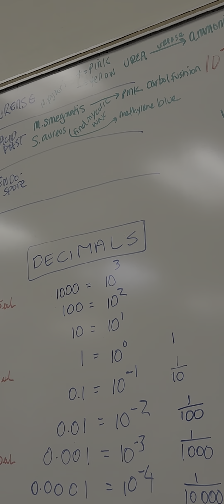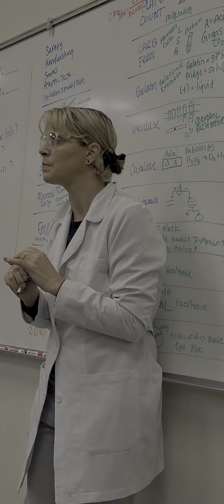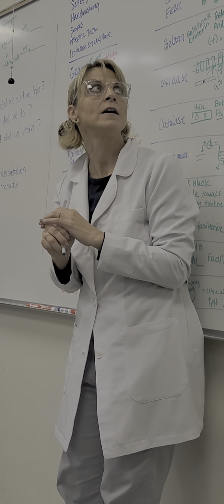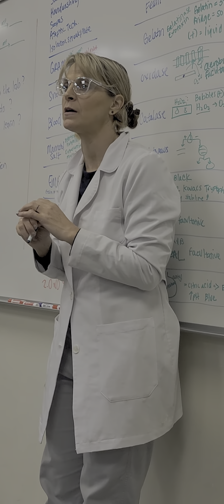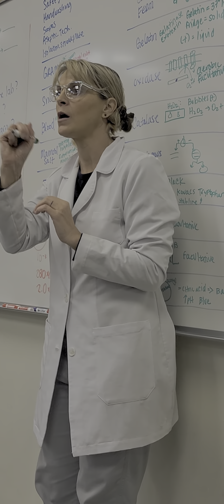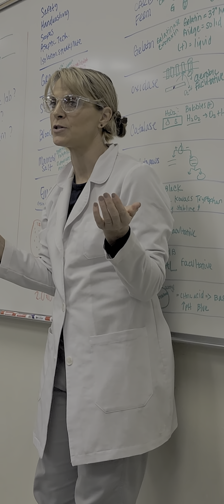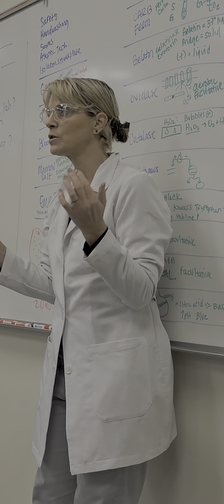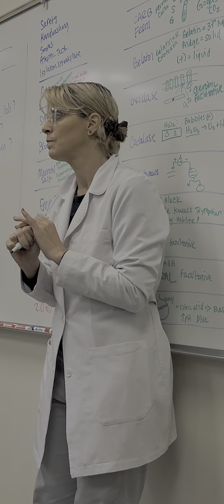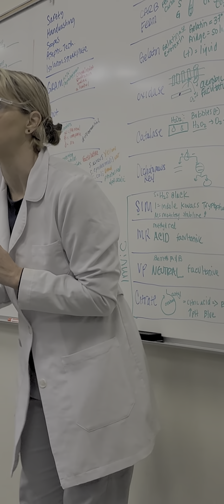So if on the exam there's a microscope there and it has hot pink bacilli and blue cocci, then we know that that's probably Mycobacterium. It looks like Mycobacterium and Staph aureus. Yeah? And we're looking for tuberculosis.